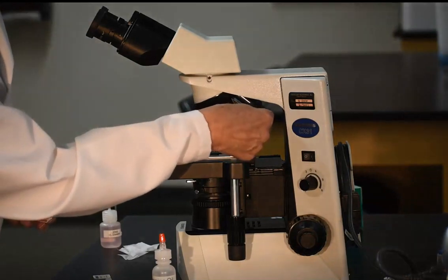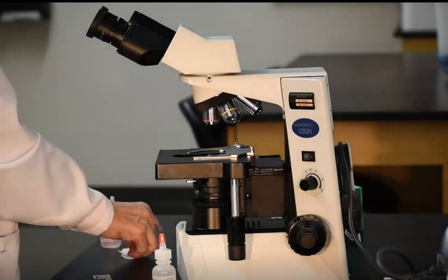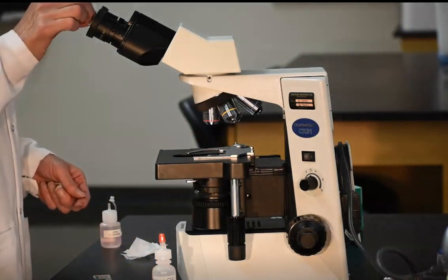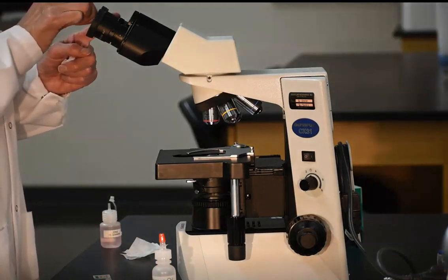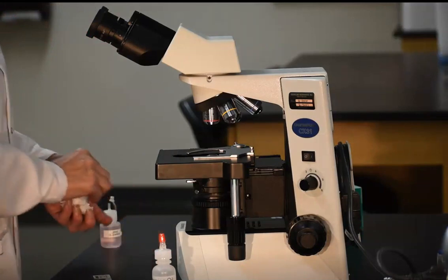If the oculars have dust or oil, use fresh lens paper and perhaps a drop of lens cleaner to clean them. Don't use any other substance on the lenses of this microscope. You may damage them. Even alcohol can damage the coating on some lenses.